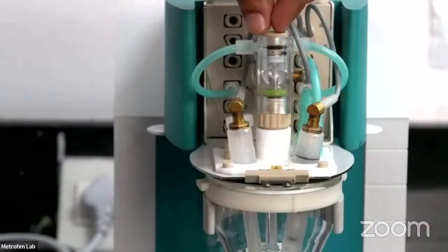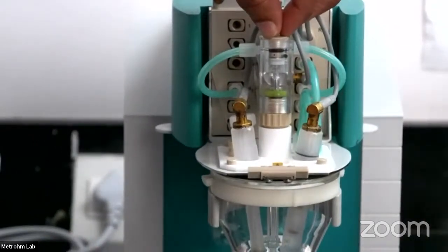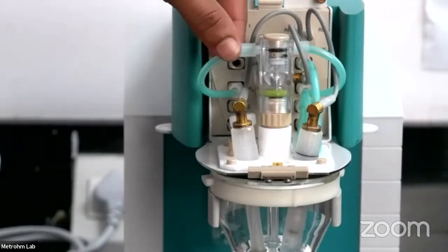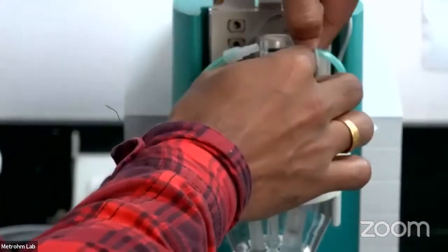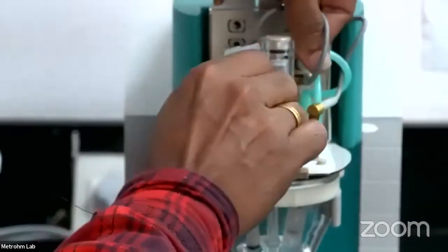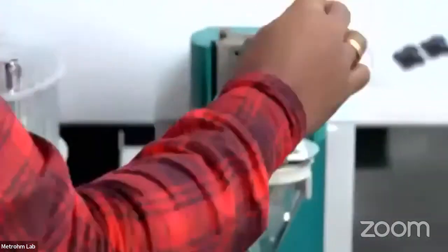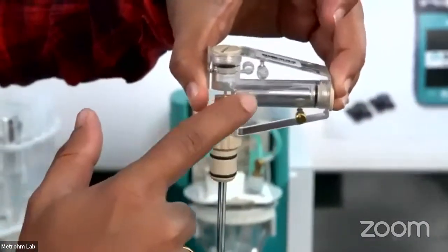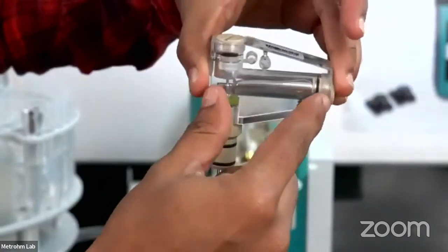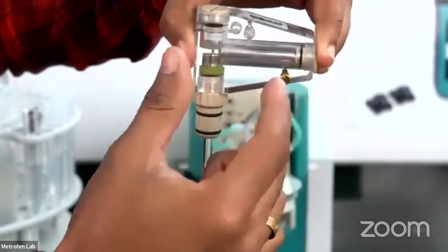Multimode means the single electrode itself can work in different modes, like HMDE mode, or hanging mercury drop electrode, or static mercury drop electrode systems, or dropping mercury electrode. So it can work in different modes. Basically it is filled with mercury, or it contains a reservoir. This is how the MME looks. It contains a mercury reservoir, which looks like this. We can fill around 6 mL of mercury inside, and this 6 mL can be used for producing around 1 lakh mercury drops.